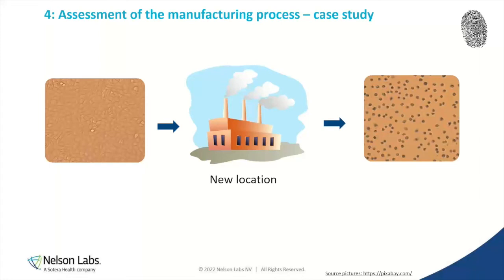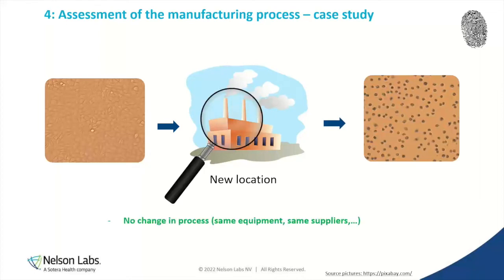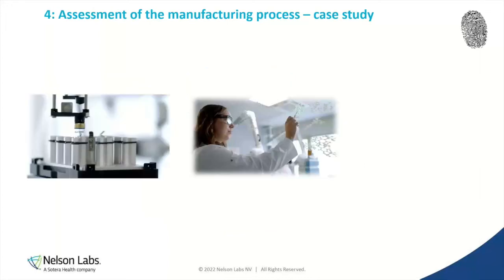They moved to the new facility and their devices failed cytotoxicity. We said, just run cytotoxicity as a quick check. They failed cytotoxicity. So we said, okay, let's look at this new location. Maybe test the same device, the device from the old location and the new location. Let's compare them on the same day in testing with the same cells. Let's see if it's something weird with the lab or whatever. No, they still failed from the new facility.